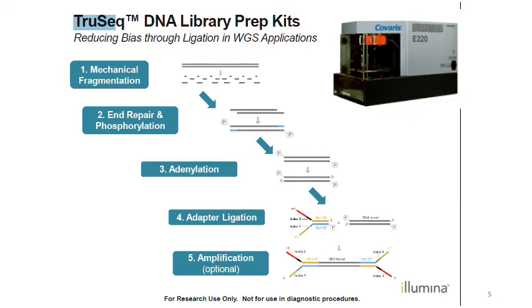Preparing a specimen for next-generation sequencing is laborious and expensive. Next-generation sequencing requires a large amount of pure DNA. Illumina library preparation requires 1 microgram of DNA. For superior accuracy, DNA is quantitated using fluorescent dyes. Nucleic acids isolated using commercial kits are usually of a good quality, but the saying junk in equals junk out really applies here. Illumina recommends using an agarose gel to determine whether or not there is contamination of your DNA before proceeding with library preparation.